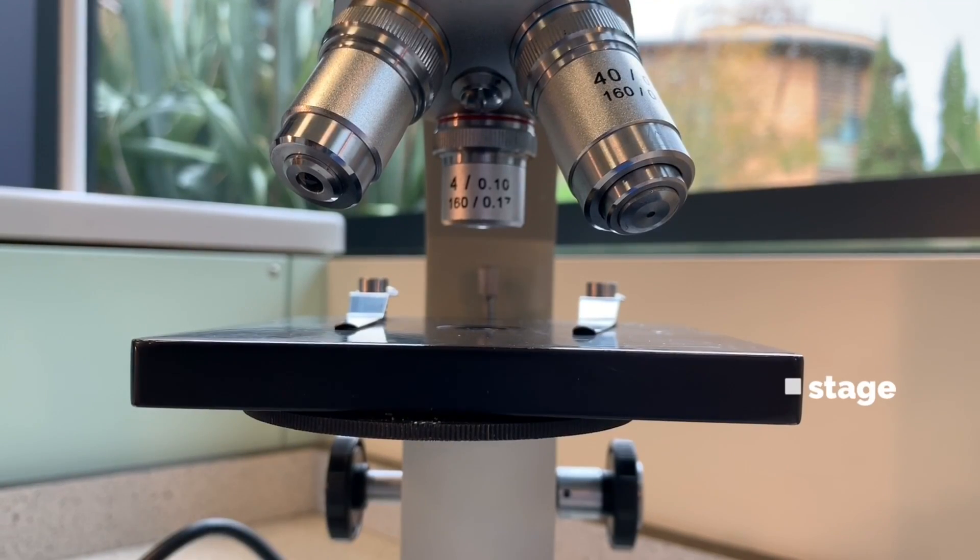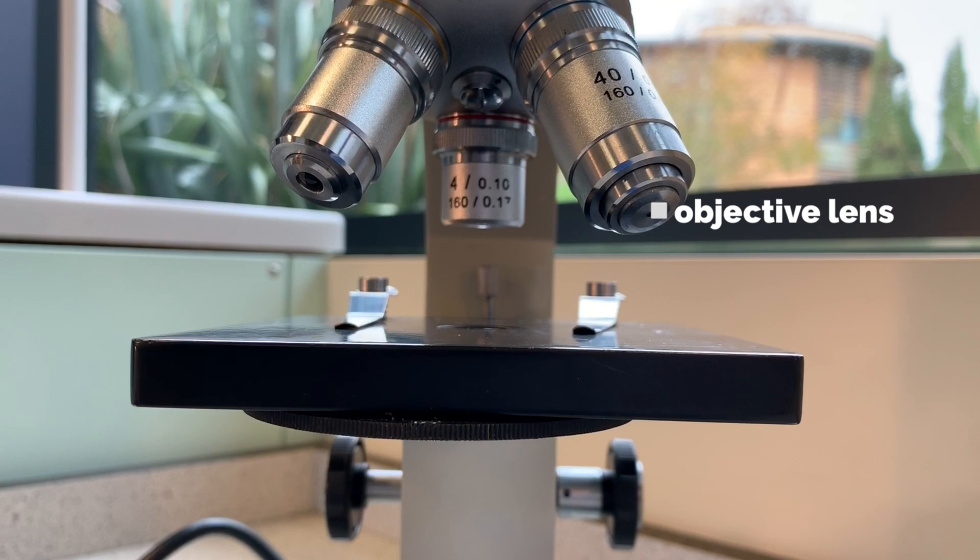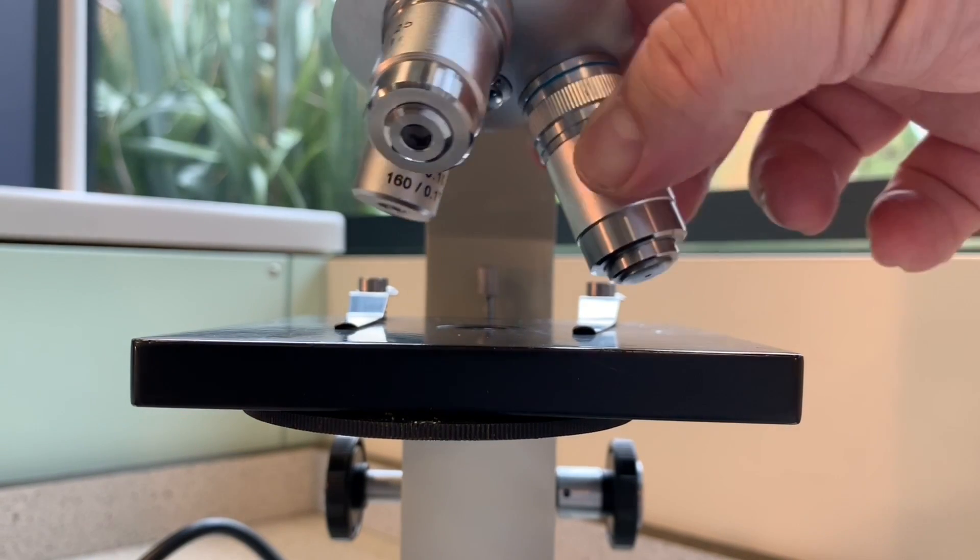The light then passes through this next part which is called the stage. And this is the area where our slide will sit. The light will pass through the stage through our specimen and this is where our objective lens then focuses on the image.